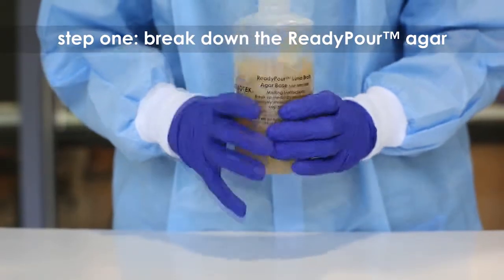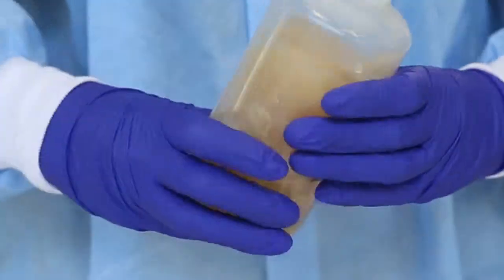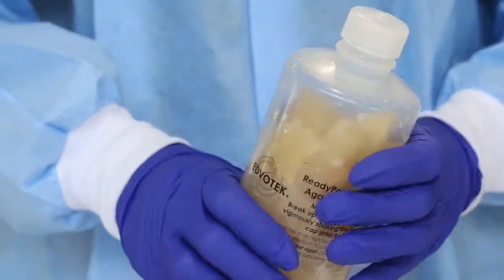Step 1: Break the solid ready pour agar medium into small chunks by squeezing and shaking the plastic bottle. One large bottle of ready pour will make five large LB source plates and 40 small plates.